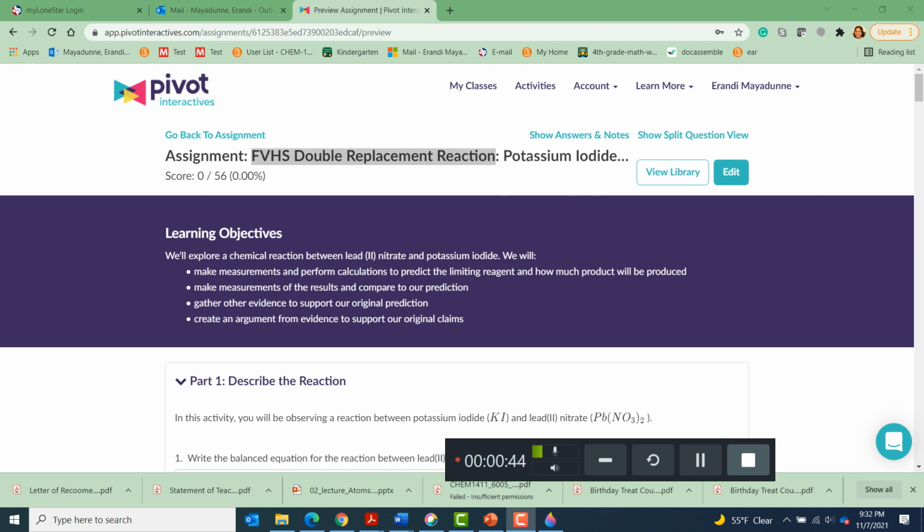This is a very interesting reaction in chemistry, showing a good color change reaction. The reaction is between lead nitrate and potassium iodide. So at the very first, when you look at it, it says lead(II) nitrate. That makes you think, why did they put 2 there, why not just write lead nitrate? No, you can't do it, because lead is an element that shows more than one charge.